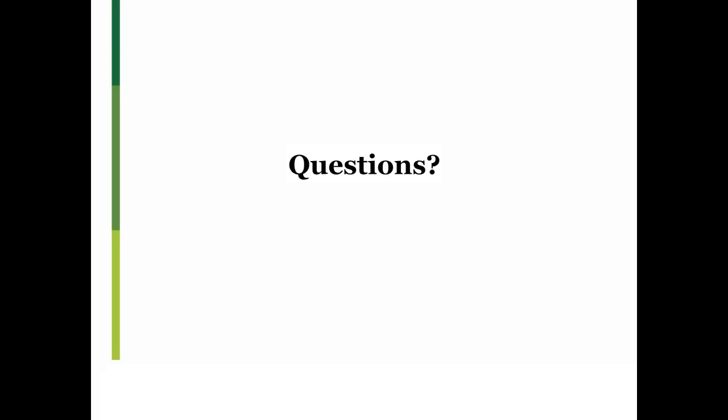I can't give you a definitive answer, but I think that one approach could be to use flow sorting with a live/dead dye, and then sort the live cells directly into Trizol for RNA-seq. That could be one approach. I don't know whether that would introduce additional biases, but that's an approach that we've used effectively for getting RNA-seq data from isolated immune cell populations, for example, from flow cytometry. Okay, and here's the next part of their question.